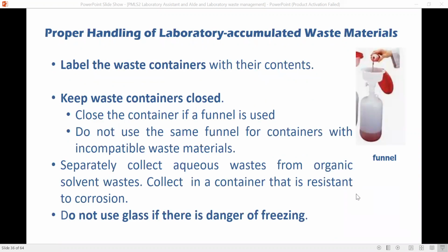Okay. So label the waste containers with their contents. Paulit-ulit lang yan. So ano ba yung nakalagay dyan? Ilalagay mo lahat, yung anong waste ang tinapon mo dyan. And keep waste containers closed. So kung yan ay may funnel, tanggalin mo yung funnel and i-close mo. May mga containers ngayon na may built-in funnel, may cover din siya. Pag wala yan, tanggalin mo yung funnel mo and then close mo yung container mo. And do not use glass if there's danger of freezing, kasi pag freezing, mag-expand, pwedeng mabasag yung glass.